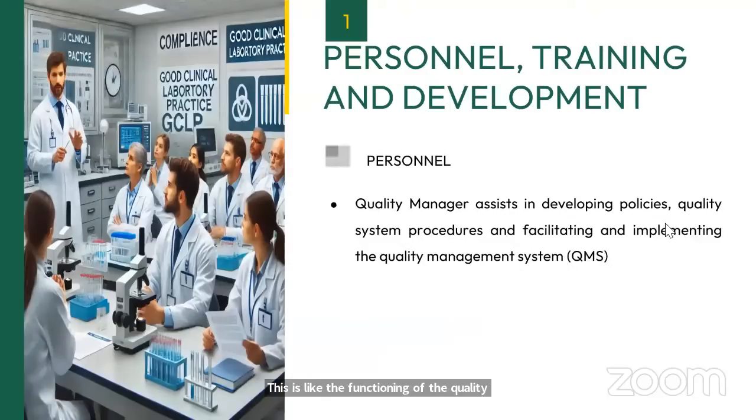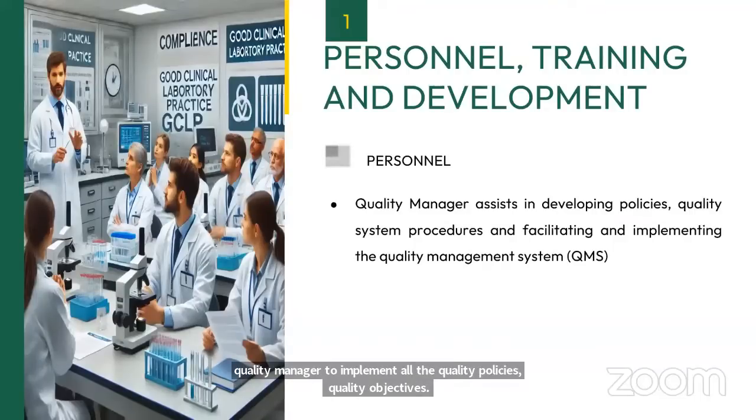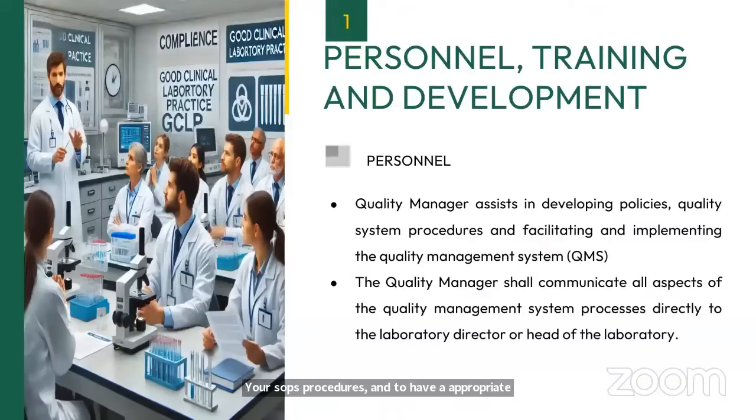This quality manager also assists in developing policies, quality system procedures, and facilitating and implementing the quality management system. So it is the responsibility of the quality manager to implement all the quality policies, quality objectives, your SOPs, procedures, and to have an appropriate implementation of the quality management system.